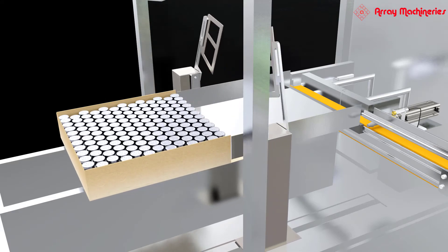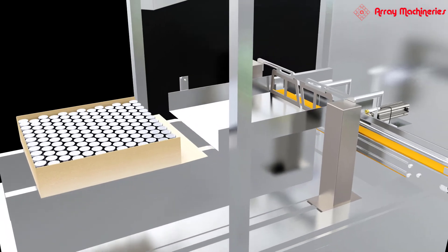Then a hinge pusher racks in to take all vials onto the cardboard container.